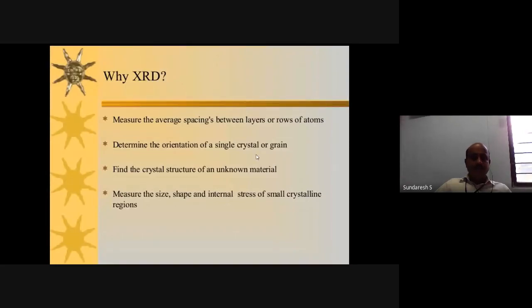Most importantly, it finds the crystal structure of an unknown material.